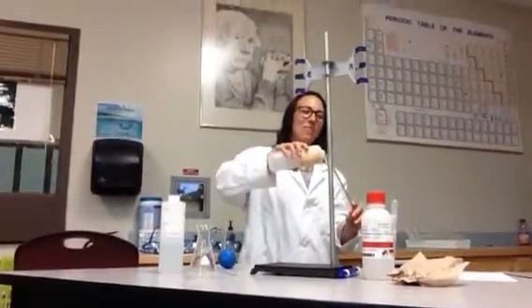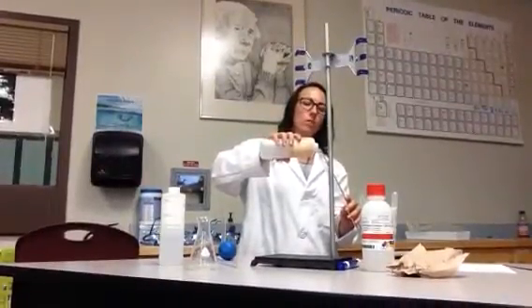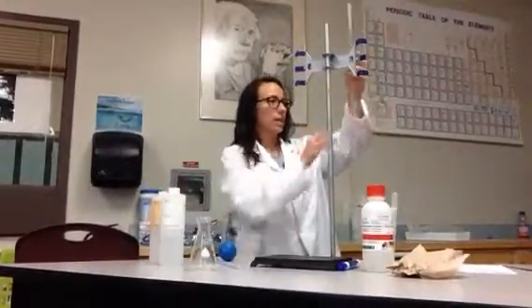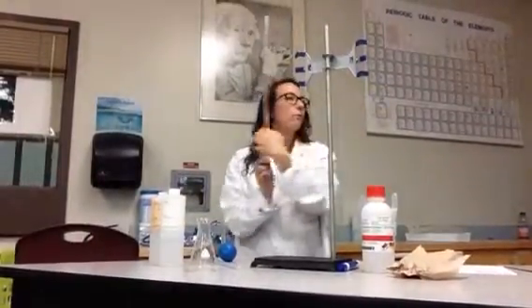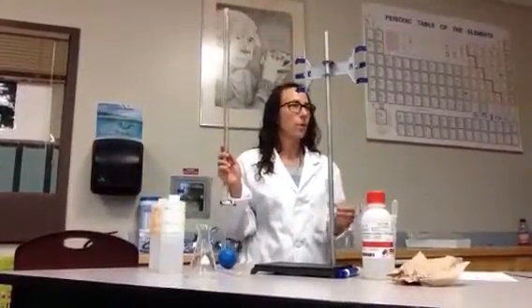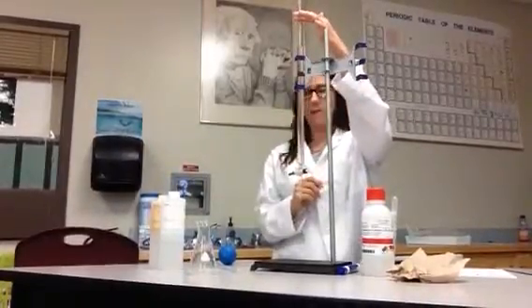Then you don't have to fill it up to the 0 either, because all I'm concerned about is how much is coming out. So I can start at 48 and end at 58, and I know that I've had 10 come out. Everybody okay with that? All right, so in here is my base.